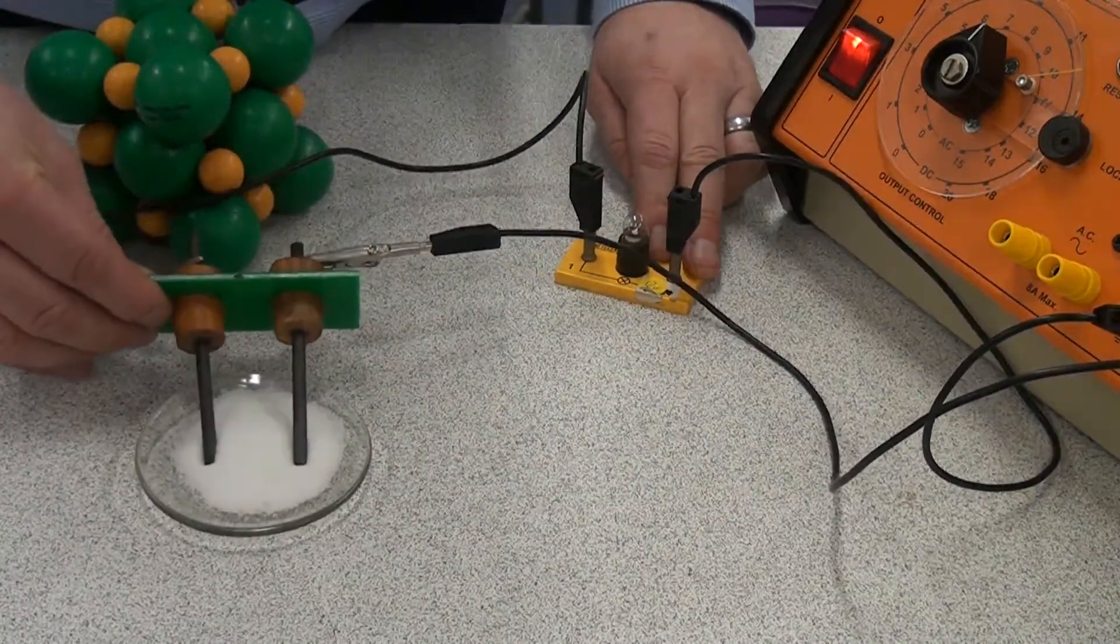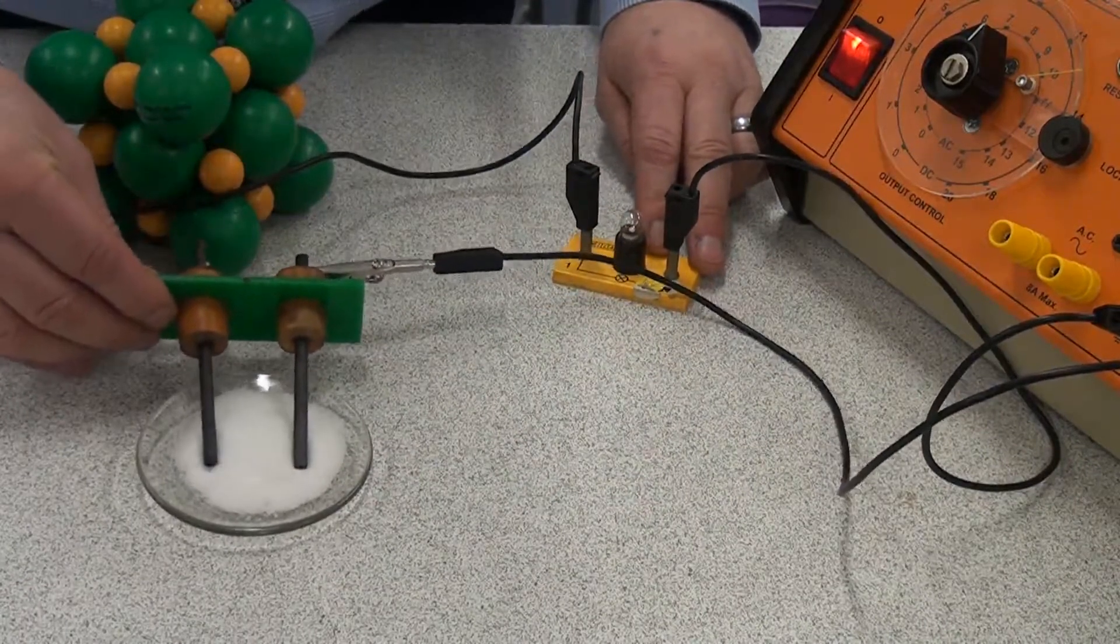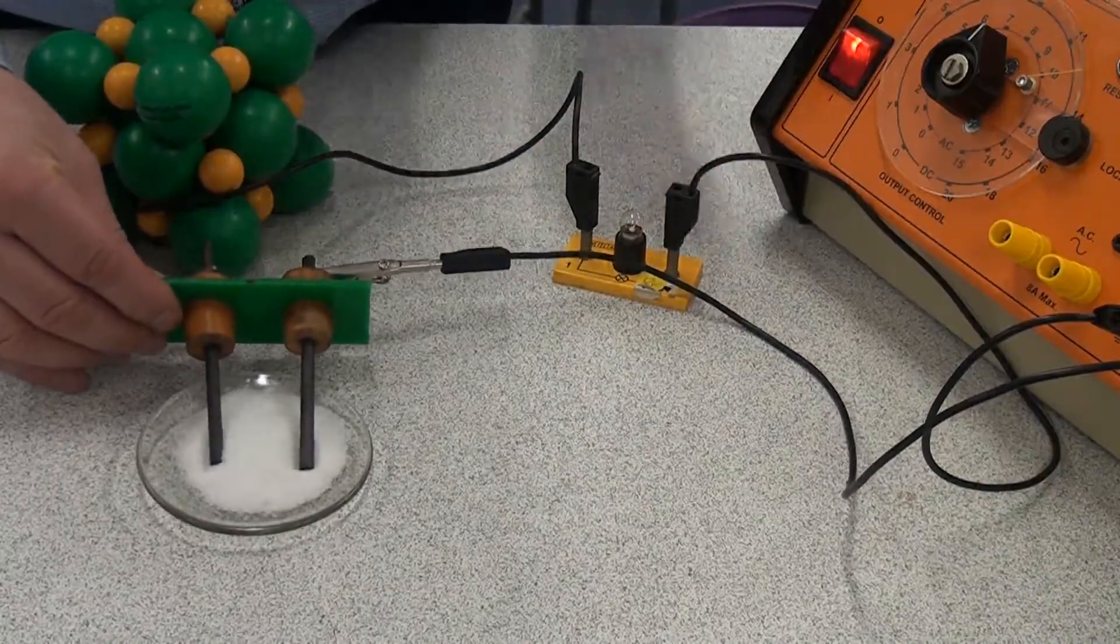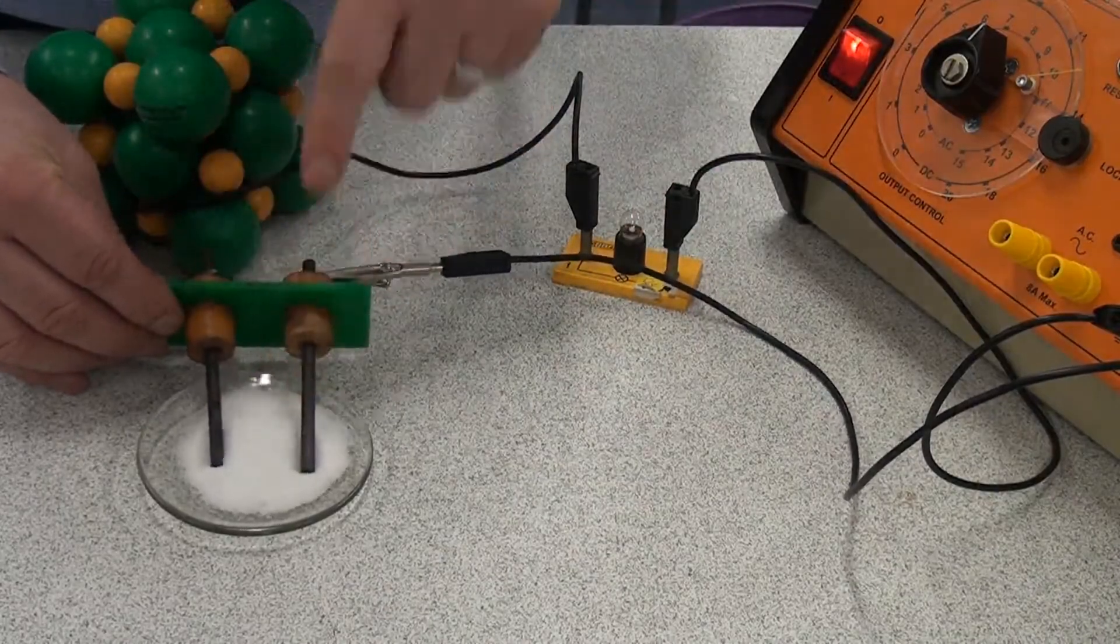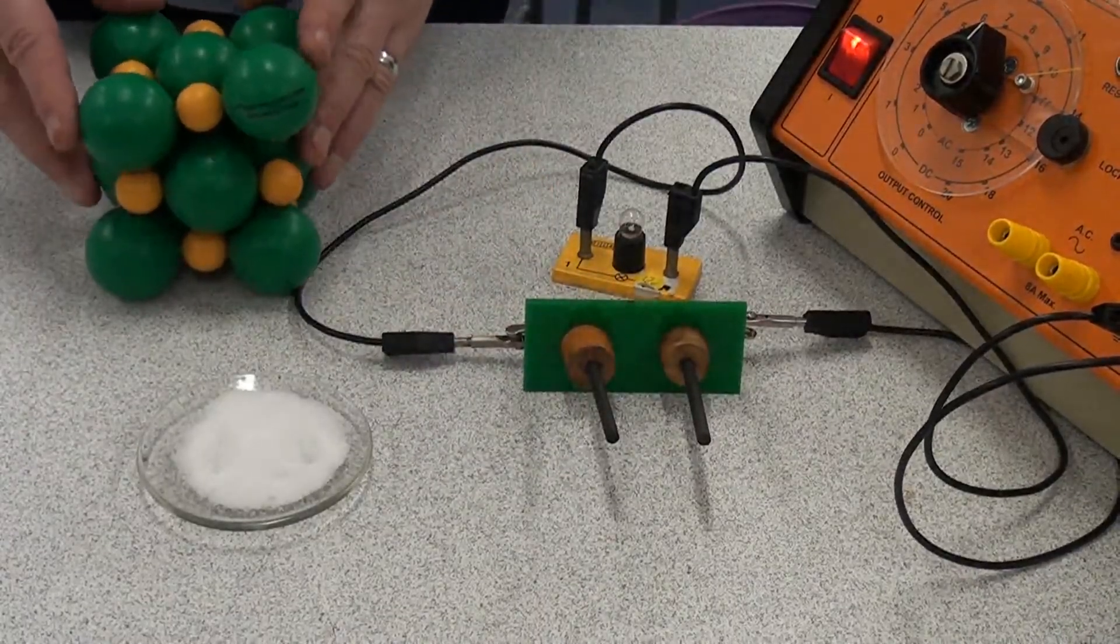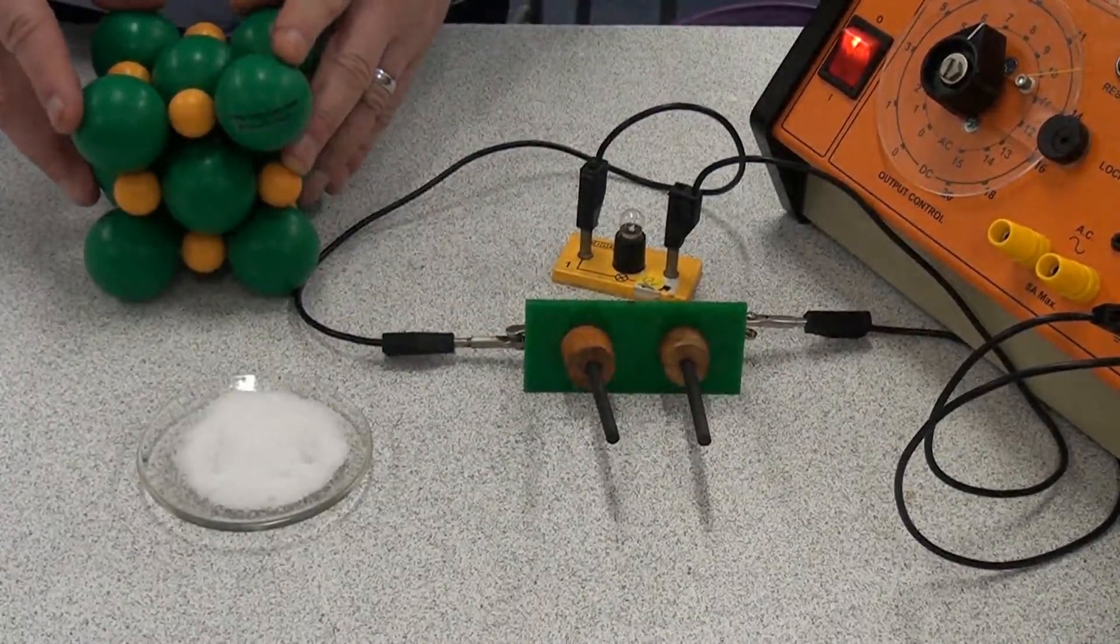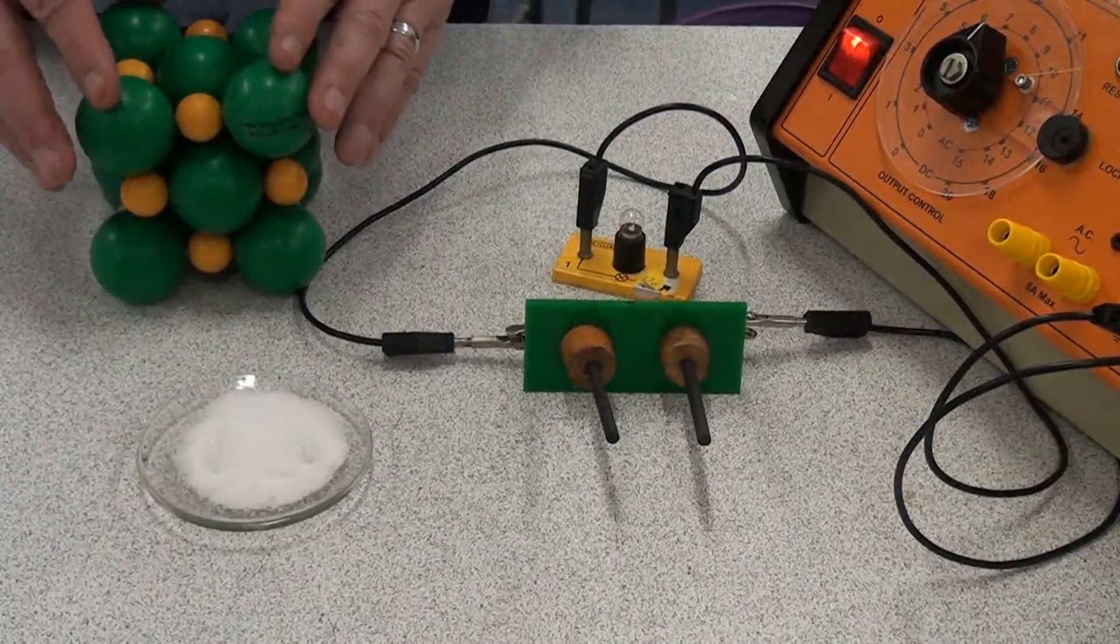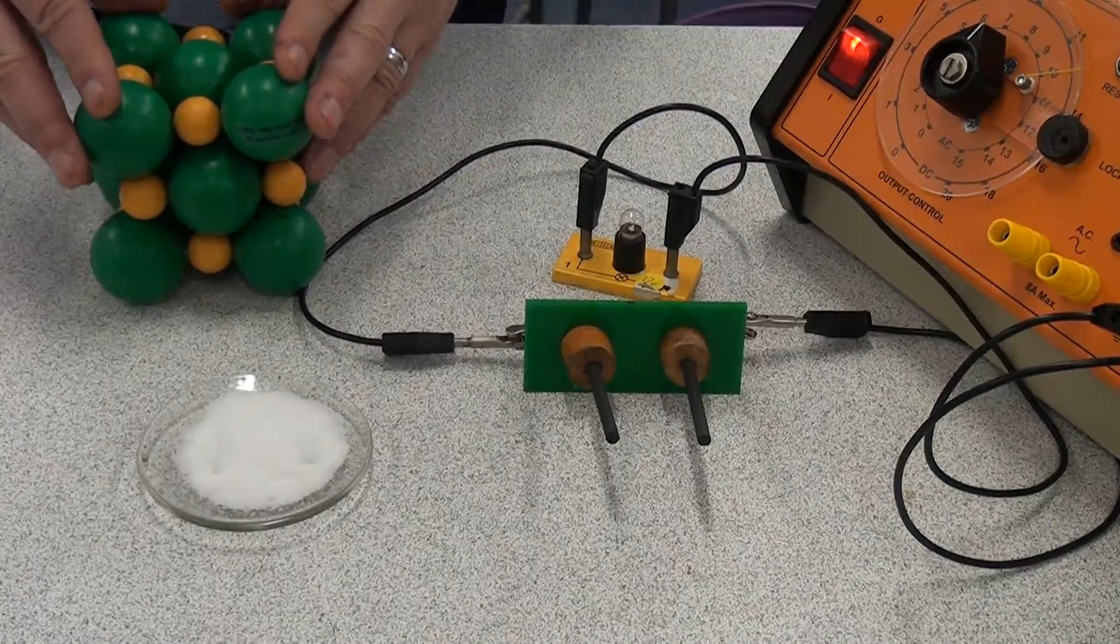Well, as you can see, when it's a solid, the ionic compound can't conduct electricity. Electricity isn't flowing between these two carbon rods. And the reason for that is the ions are held in place by those strong electrostatic forces. So the ions are fixed in position and aren't able to move.